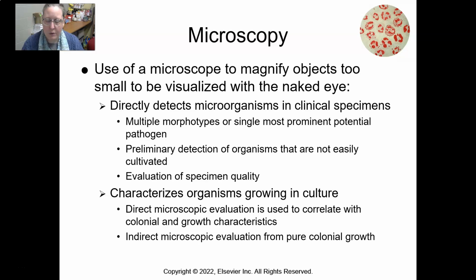It should usually be a single one, but maybe there are several on a plate, and we can then see what each one is. And we can correlate with the way the colony looks and its growth characteristics, and we can see if it meets what we expect it to be, on the gram-positive, gram-negative reactions and its morphotype.